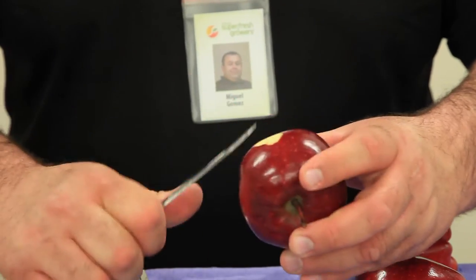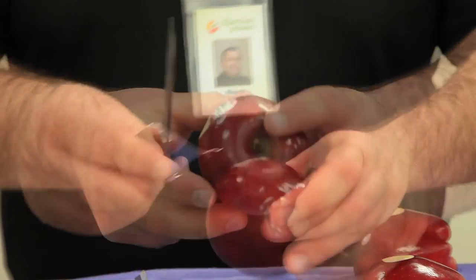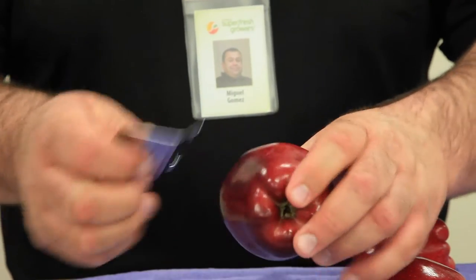The peel should be between one half and three quarters of an inch in diameter. This can be done with a knife, but a fruit peeler is preferred as it provides more consistent test results.